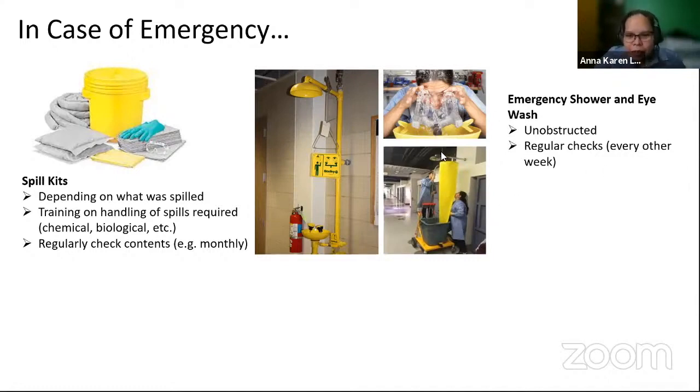And this is one way of doing your regular checks. You have to make sure that there is water coming out, of course. You have some containment to contain the water. So you really have to let it flow, let it work, and make sure that it has the water supply.